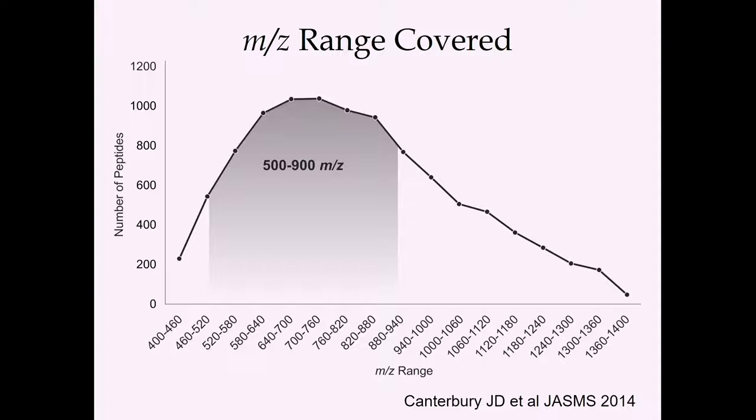There is a couple people in the lab that do 24 mass to charge wide isolation windows, but they do a trick that gives them 12 mass to charge of specificity back in the end. I'll talk about that on Thursday.